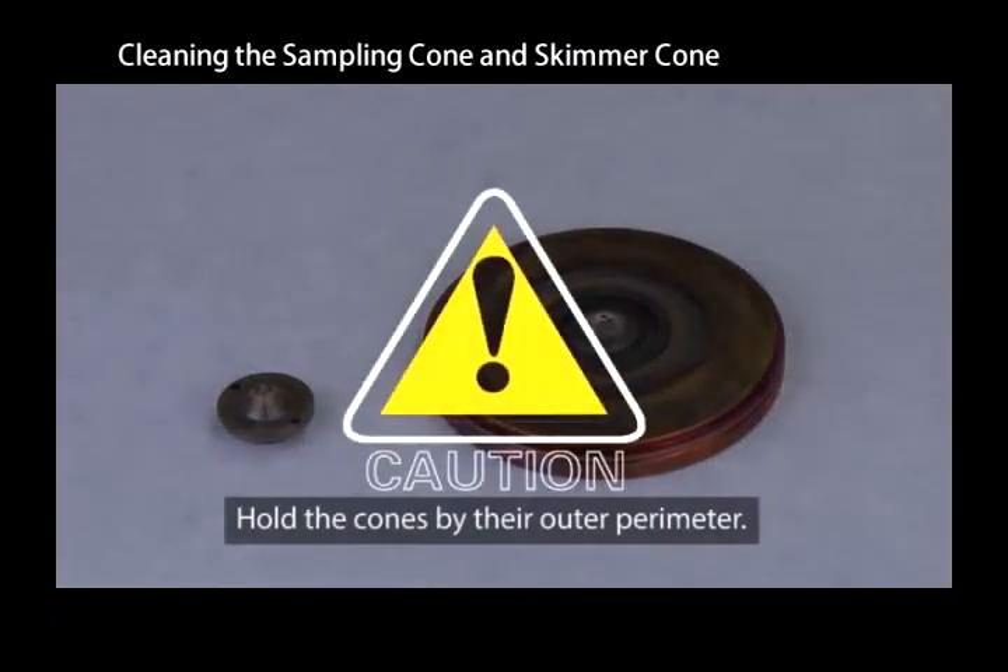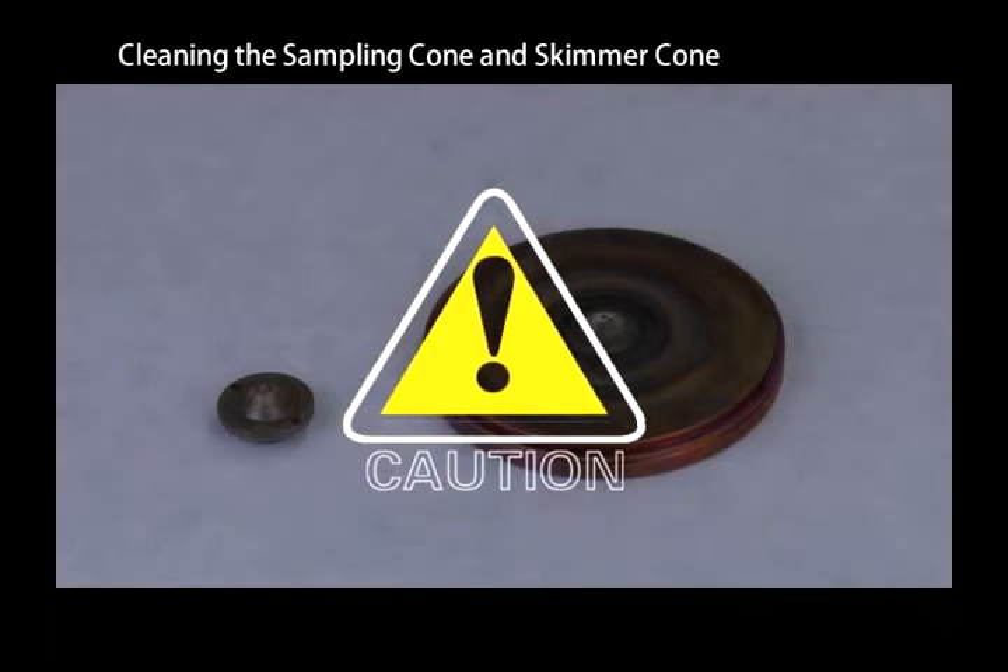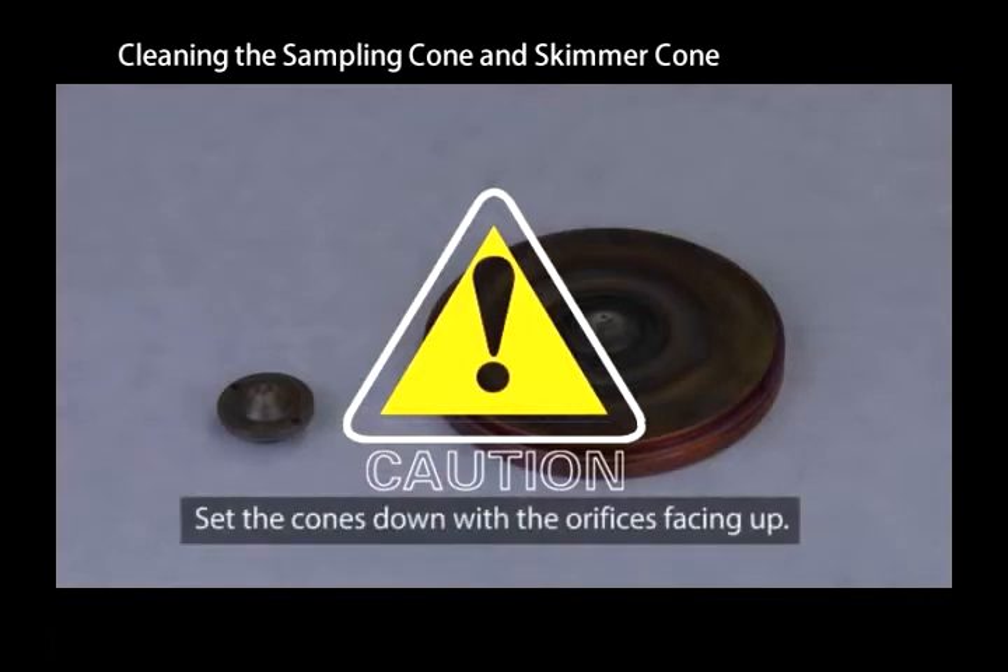When handling the sampling and skimmer cones, hold the cones by their outer edges. Never place the cones with the orifice side facing down. Even slight pressure on the orifice will damage it.